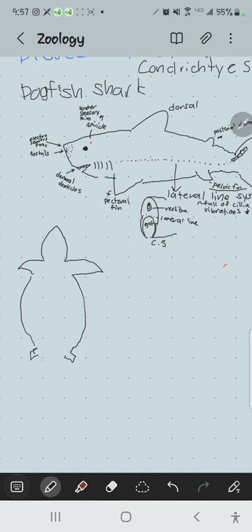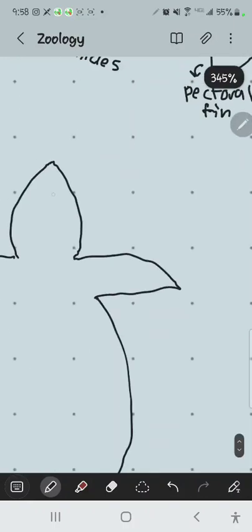Okay, so you're going to do an incision. The little opening here between the pelvic fins is called the cloaca. And a cloaca is a combined genital and digestive tract opening. So it's basically the genital system and digestive tract. There is no external urinary tract on these.